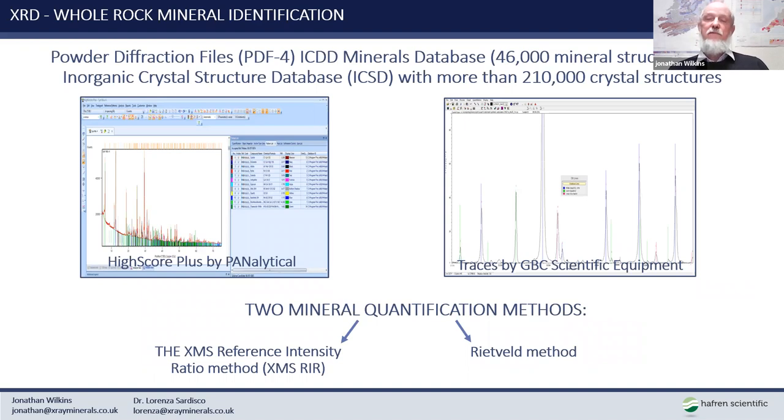And the output from this scanning process is this rather scary looking mess of peaks, which you can see in either of the two graphics, which are representing the view that we see of the software which we use for examining the outputs. Okay, so if we simply pick apart the graphic on the right hand side here, there is an intensity axis which is vertical, and there is the angular axis on the bottom, horizontal, which is the magical theta value which we found in our Bragg equation.